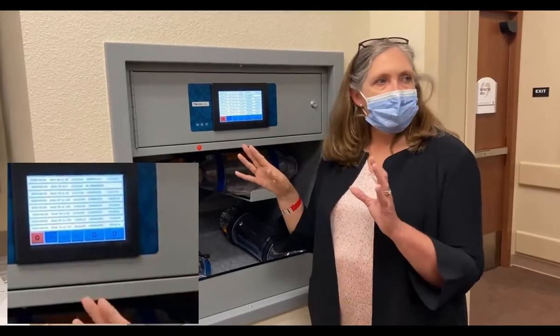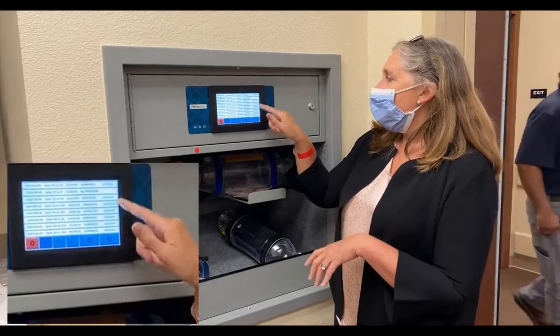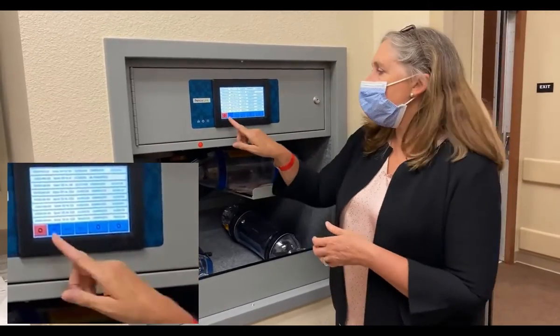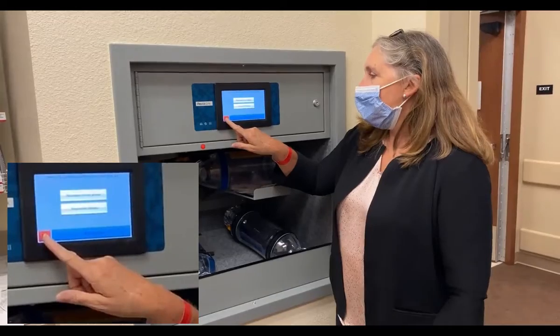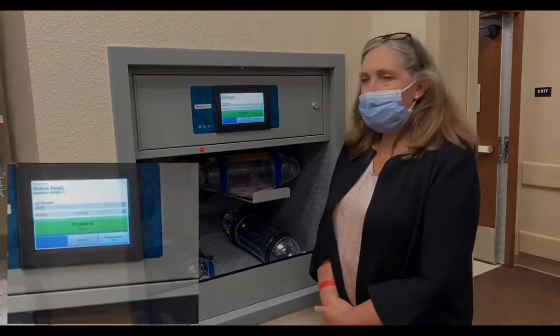So if you wanted to verify that something got to the lab, you could look on this. It would say complete. It would tell you what time it delivered. So it's just a little quick visual info screen for you. That's pretty much it.